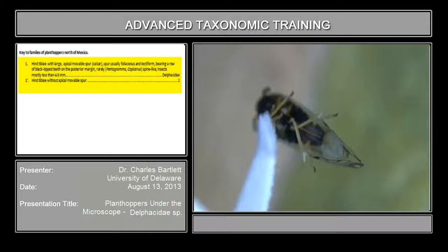They're not unique to Delphacene, but they're both features of the Delphacene. And Delphacene are the group of delphacids that you're going to see by far the most.